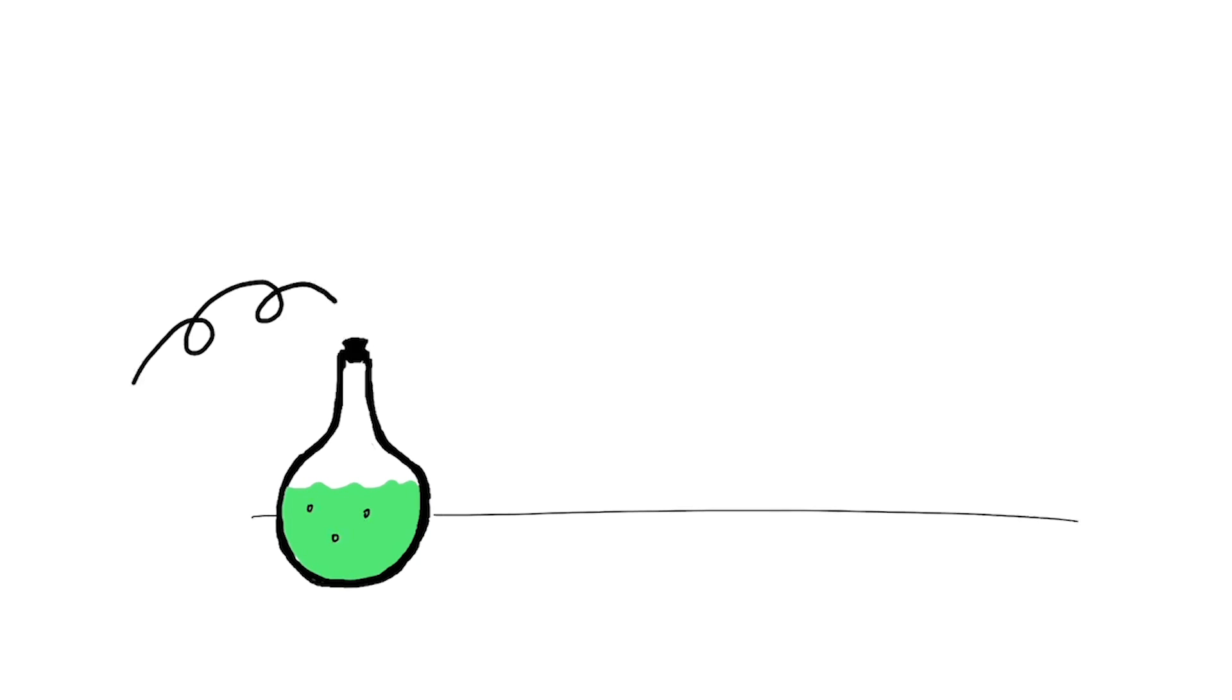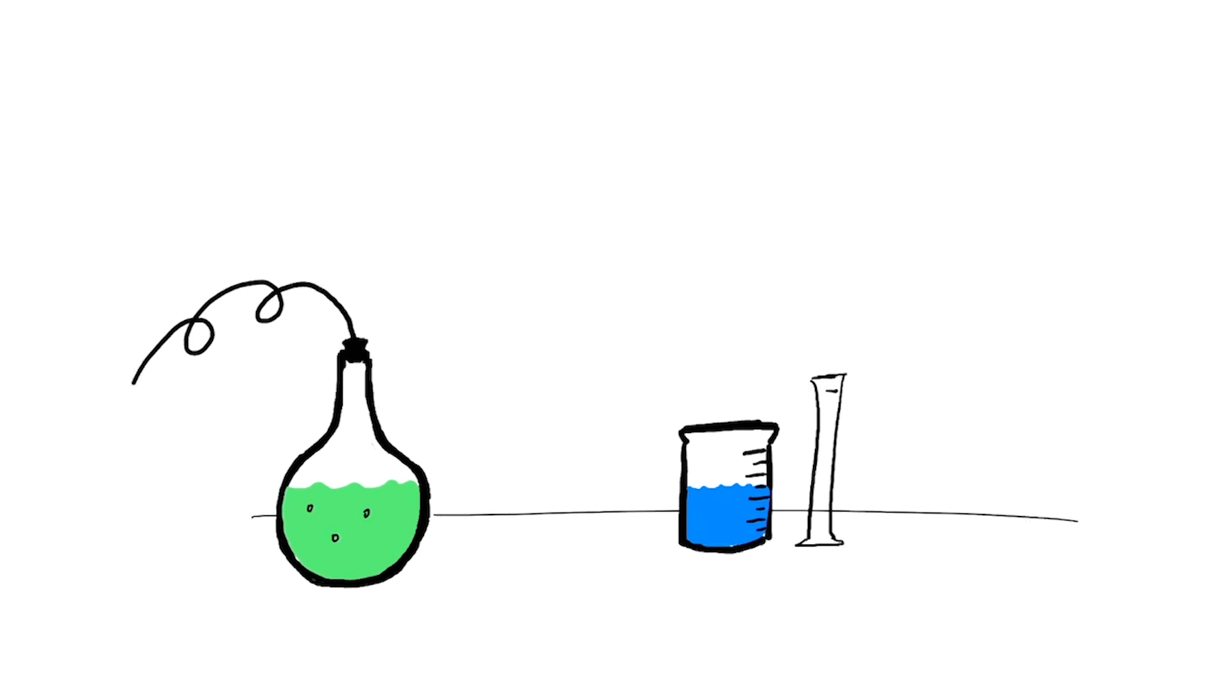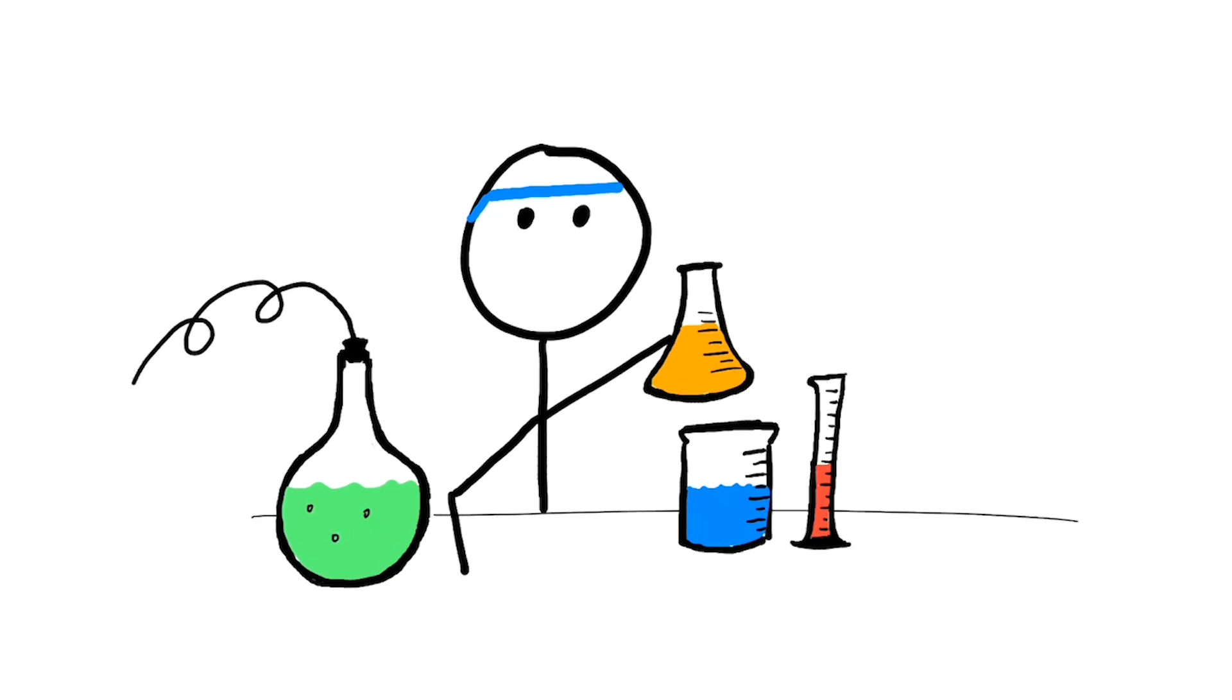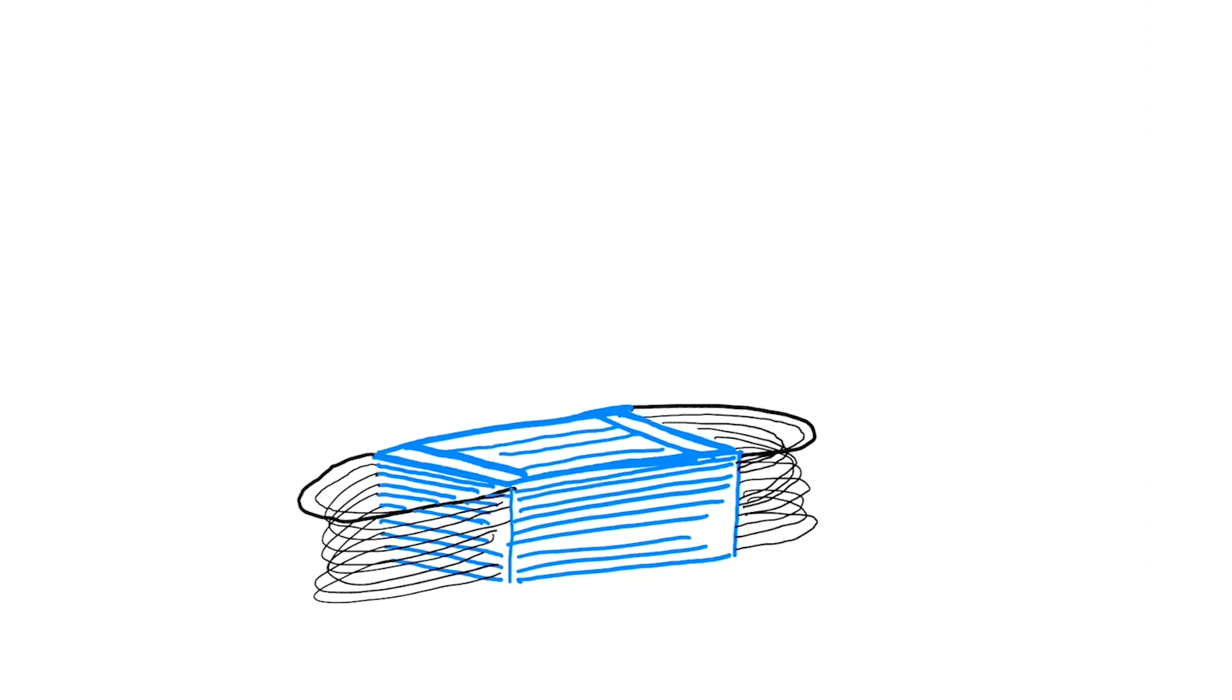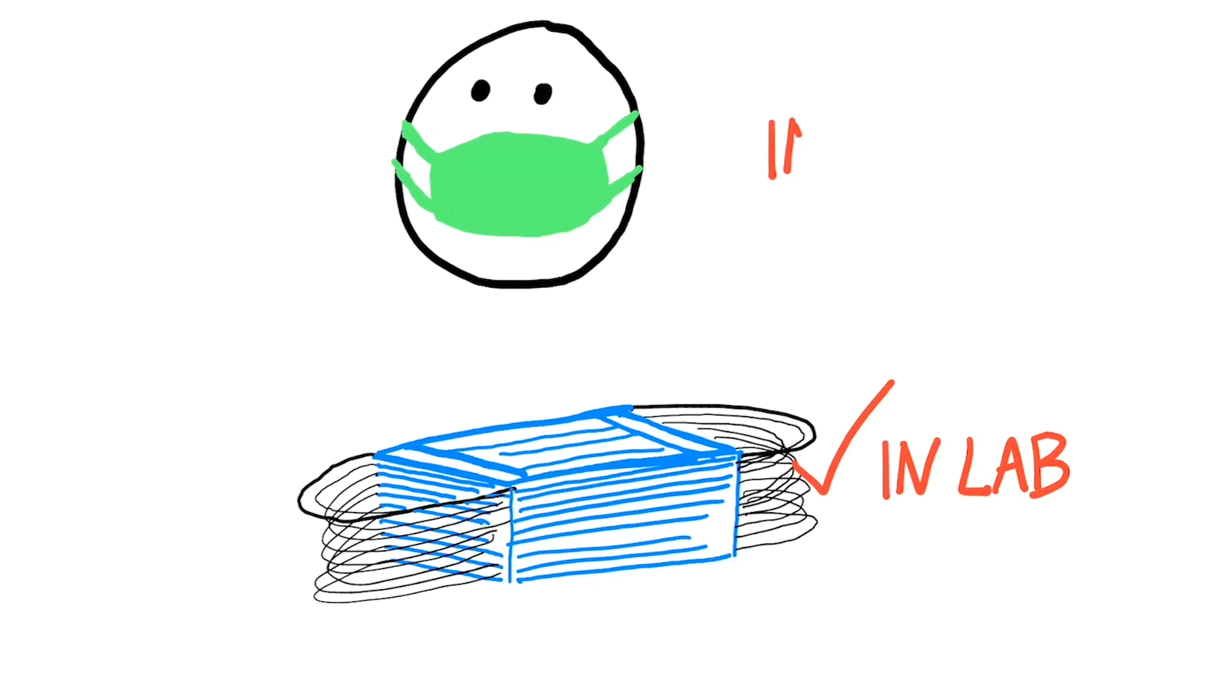During Yale's Phase 1 reactivation of campus research, trainees, faculty, and staff are required to wear surgical masks while in a laboratory. Each individual returning to work in a lab will be provided a supply of disposable, water-resistant surgical masks for their use in the lab. Cloth face coverings are not allowed in Yale labs.